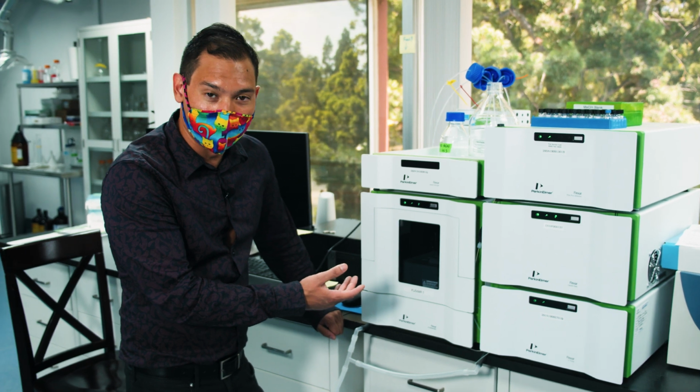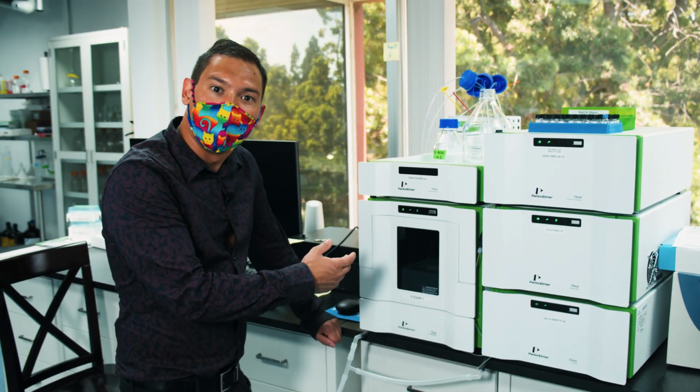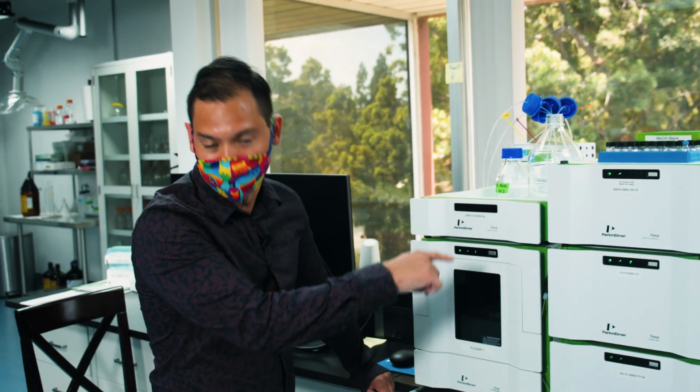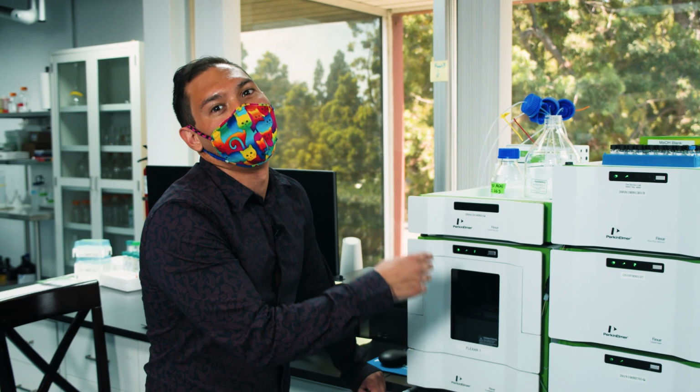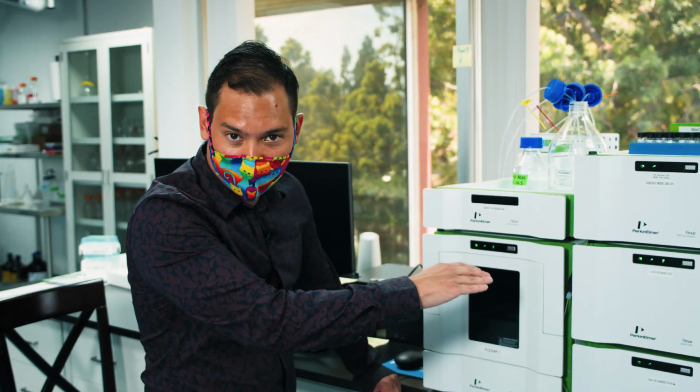And in this case, it's shooting a wavelength of UV light, and the cannabinoids are going to absorb that particular wavelength of UV light. And this is going to cause different peaks, which is what we call our chromatogram. Basically, what you can do is you can take the area under that curve and then use that, based on your calibration points, to quantify the amount of cannabinoids within that sample.